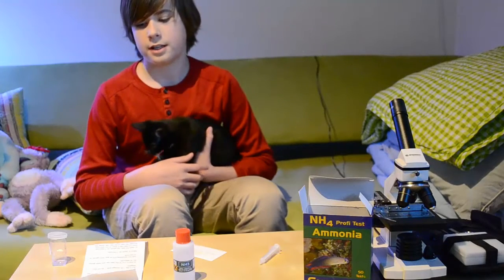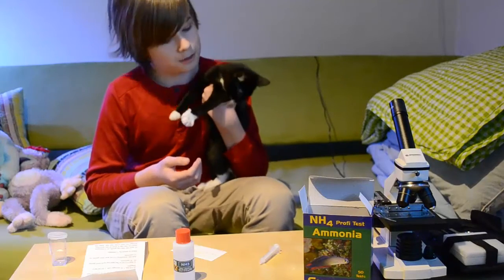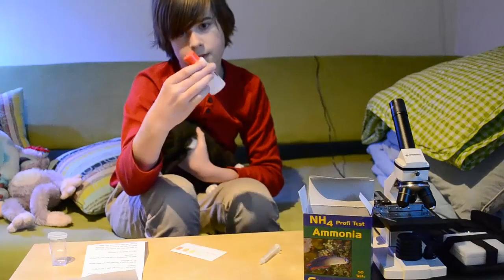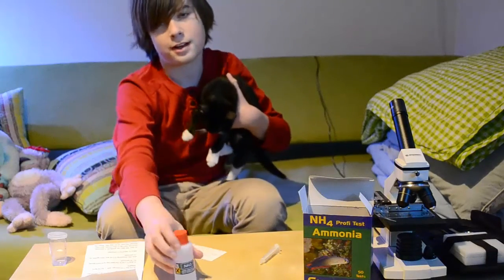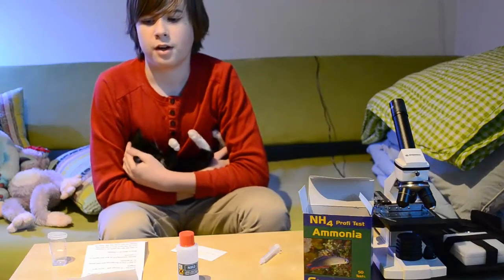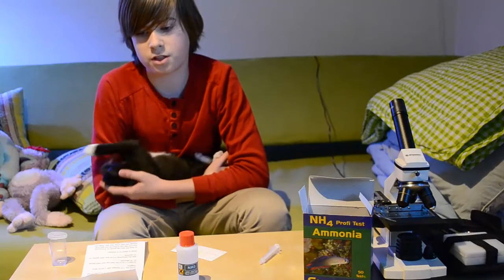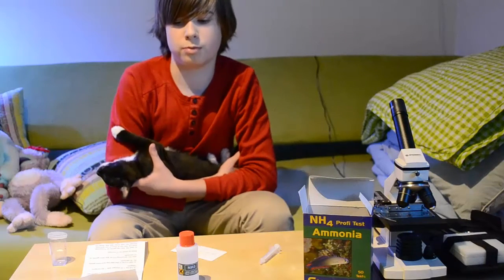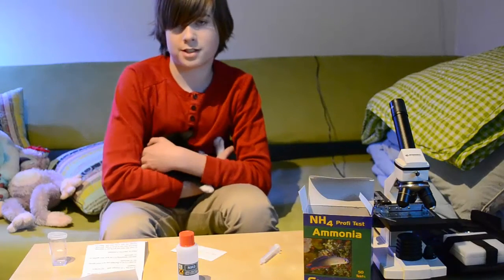The first thing you need to know is that the materials we use in this test kit are very dangerous to animals — you can see I've got a little kitten here. Especially the NH3 bottle — this is very dangerous. It can cause eye irritation and skin irritation. It contains 2% NaOH and 0.1% HG2I2. That is some pretty harmful stuff.